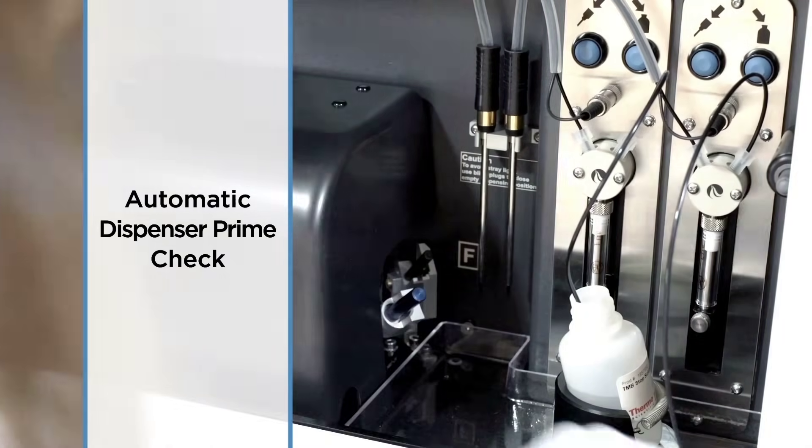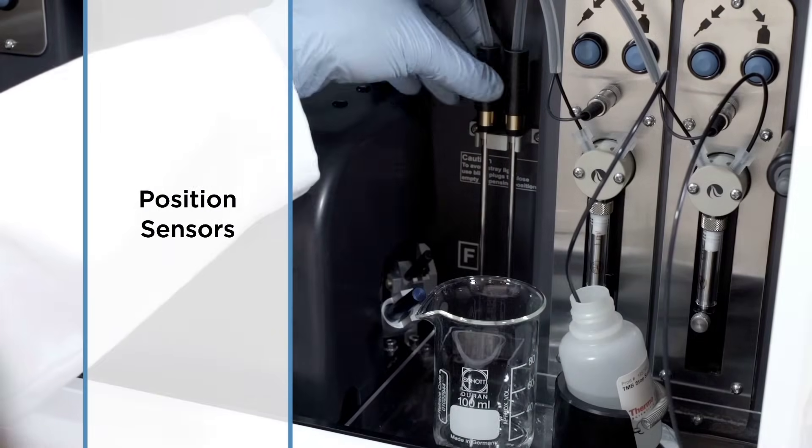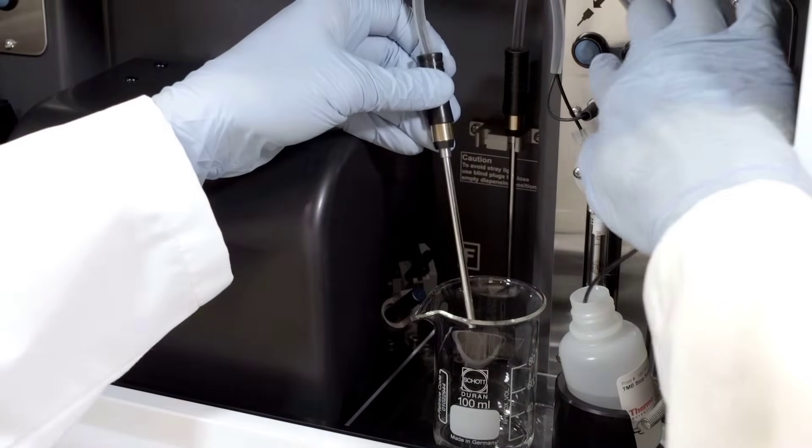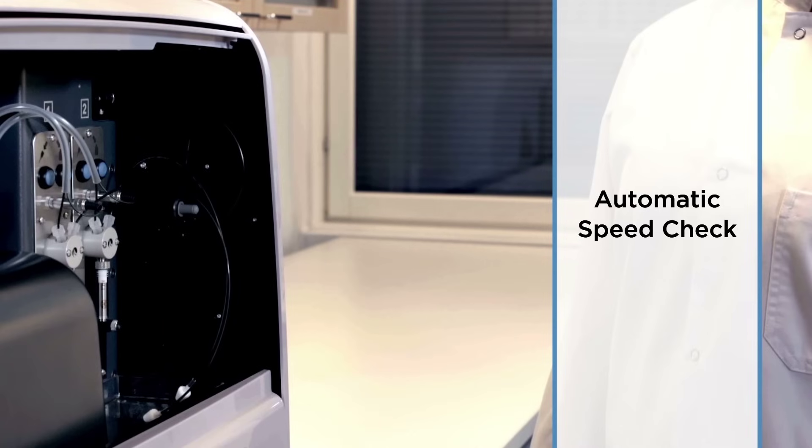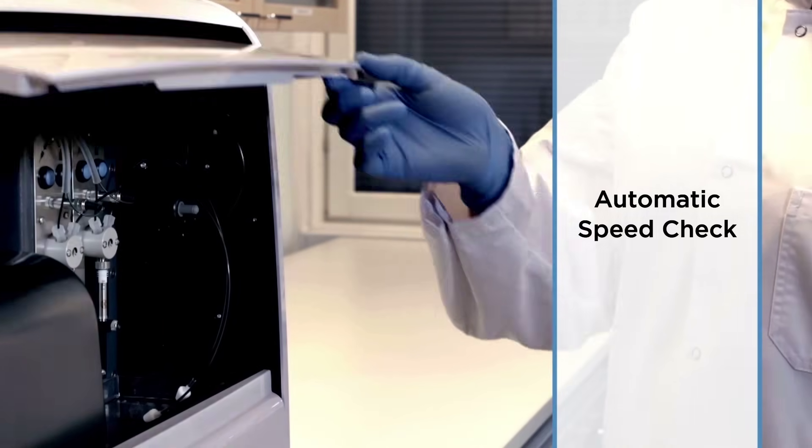Forget to prime? The VarioScan Luxe reminds you. Dispensing head misaligned? You'll know it. And when it comes to preventing spills, the VarioScan Luxe sets the maximum shaking speed based on plate format. You'll protect your samples and your equipment.